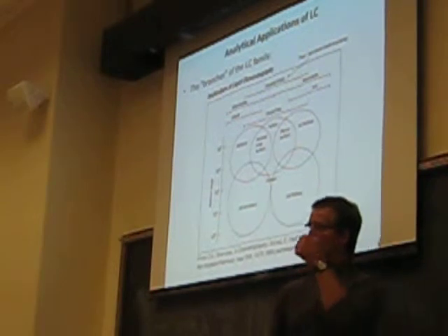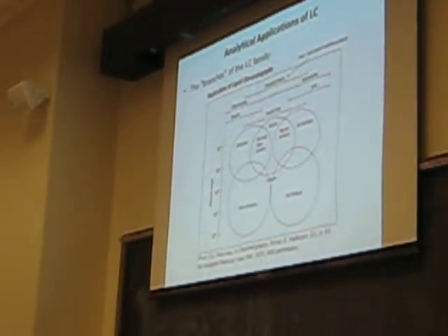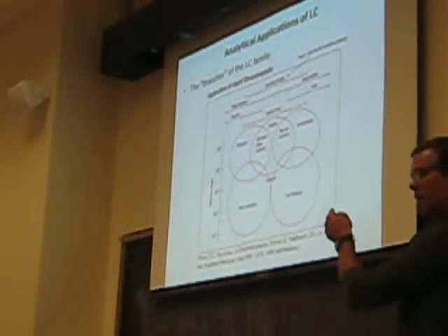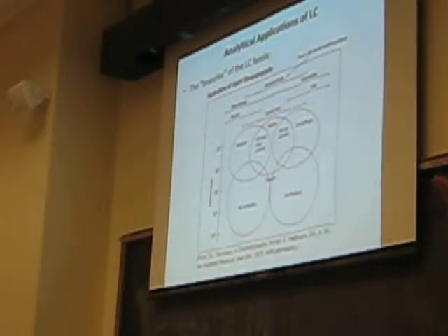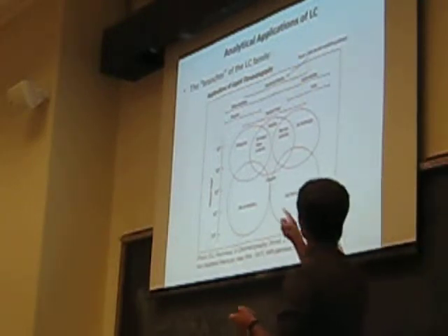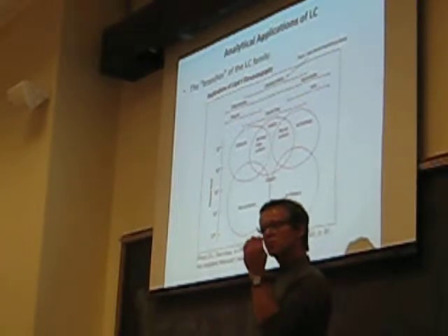Right? And so reverse phase, normal phase, ion exchange, those three kinds that we just talked about, are all based on partitioning of the analyte with the stationary phase functional group. So it's a chemical interaction, a chemical bonding interaction, electrostatic, dipole, or whatever we'll talk about that. Filtration, exclusion is not. It's just based on the physical size.